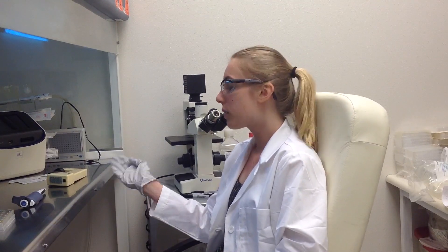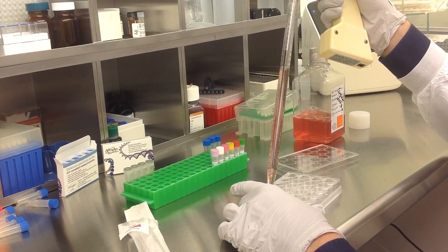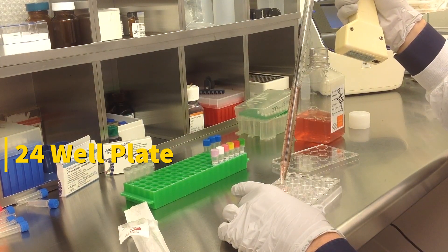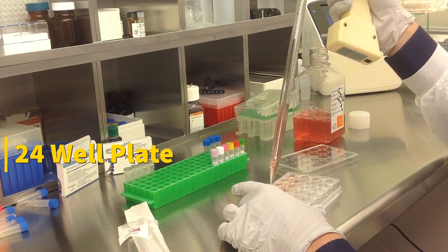Today we will be transfecting HCAEC cells obtained from ATCC. We will be using a transfection kit manufactured by Altogen Biosystems. In this tutorial, we use a 24-well plate. Transfections can be scaled up or down based on plate surface area as described in the corresponding transfection protocol, which can be found at altogen.com.